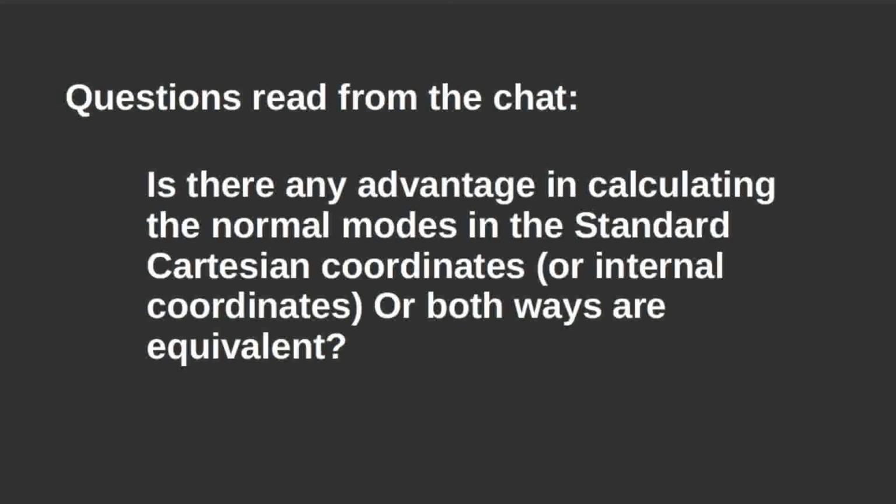But I understand that internal coordinates can be important in some other methods, like molecular dynamics methods, for example, because you can maybe more easily compute some angles between atoms than in Cartesian coordinates. So this is about the implementation.